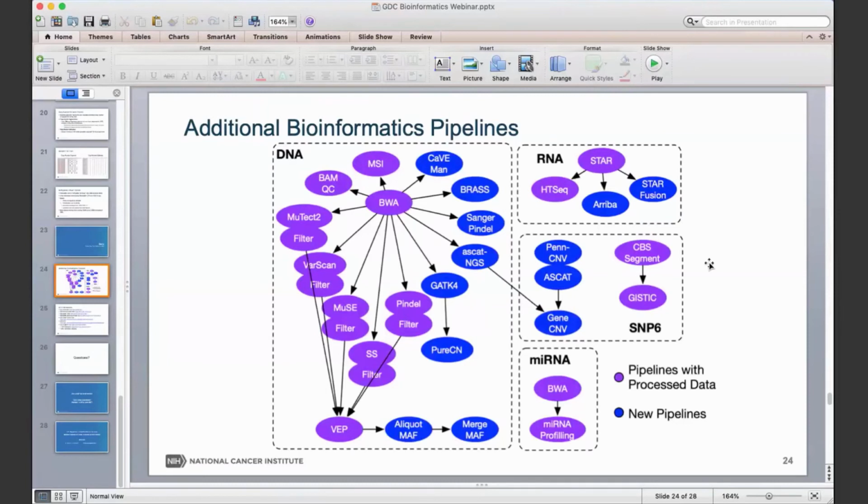For the whole genome, I won't say it's really as accurate as base level. That's really based on the coverage, but just less than megabase level. I would assume it's in the kb region, but I'm not really sure. It's actually best to look at the publication of the single tool called ASCAT. I think that's easier to check with them.